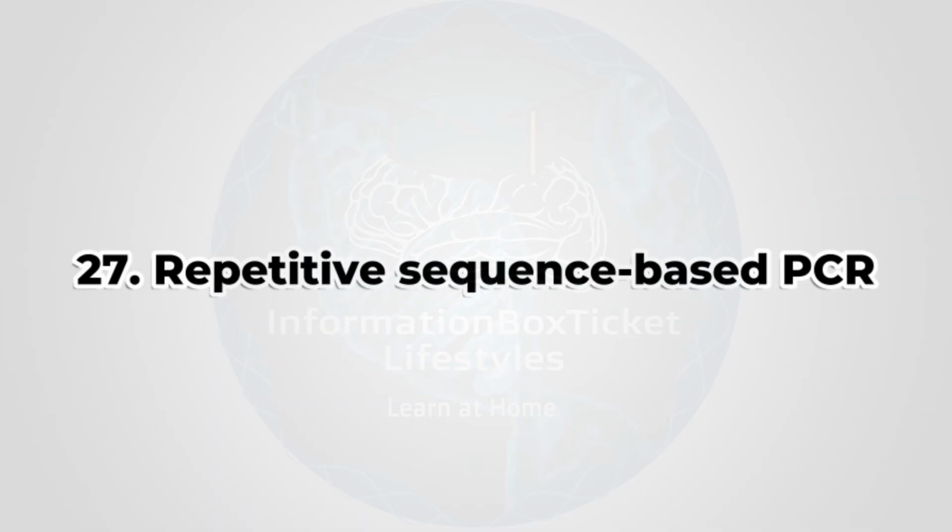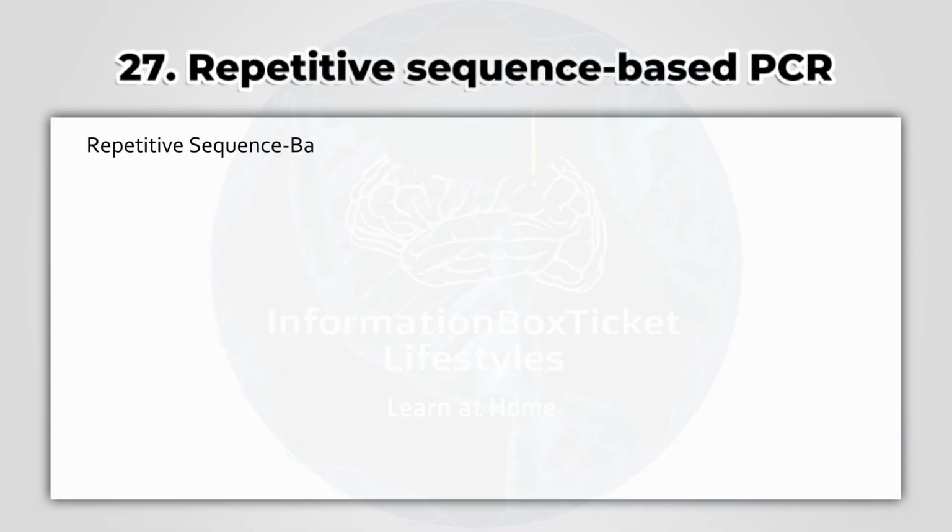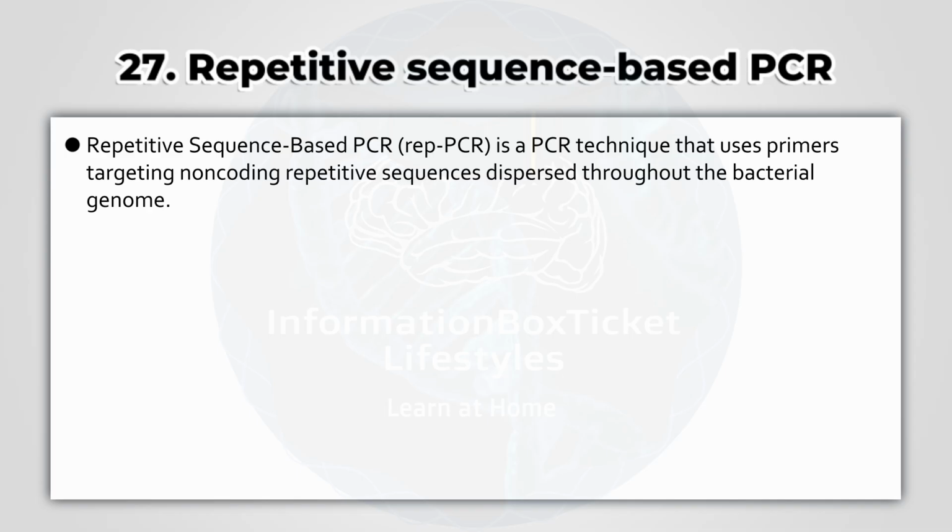27. Repetitive sequence-based PCR. Repetitive sequence-based PCR, rep-PCR, is a PCR technique that uses primers targeting non-coding repetitive sequences dispersed throughout the bacterial genome.